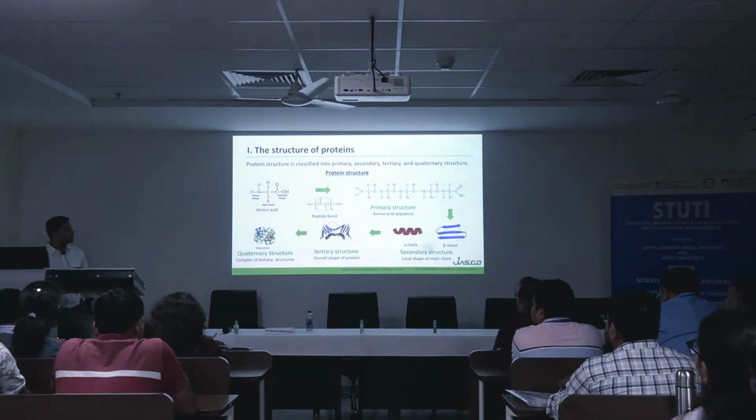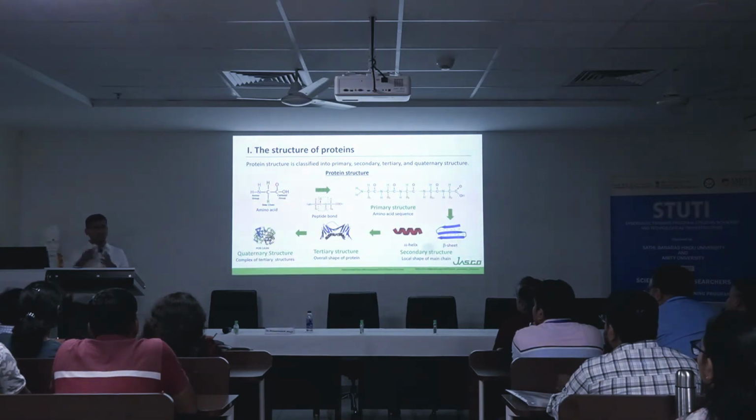Okay, so this is the basic structure of your protein. Generally, through CD we can analyze the secondary structure, tertiary structure, and somewhat the quaternary structure. Prosthetic groups we can also analyze, in higher regions as well.